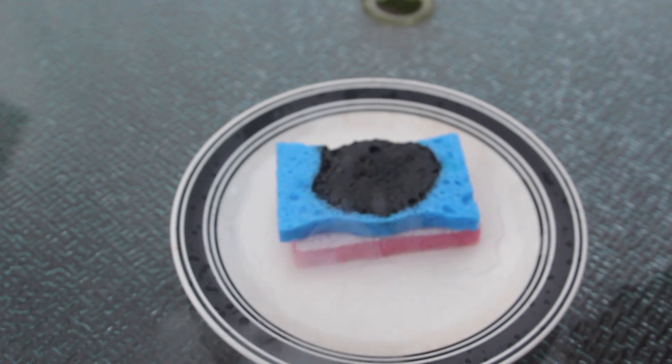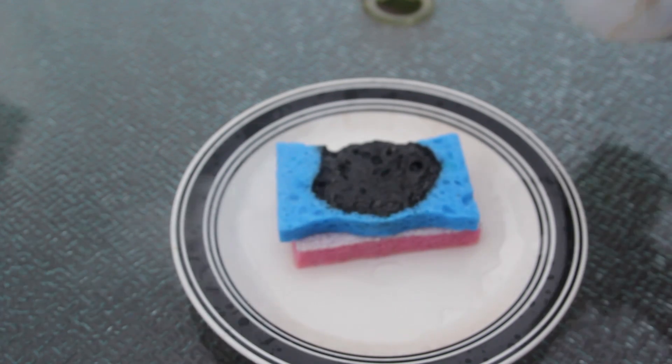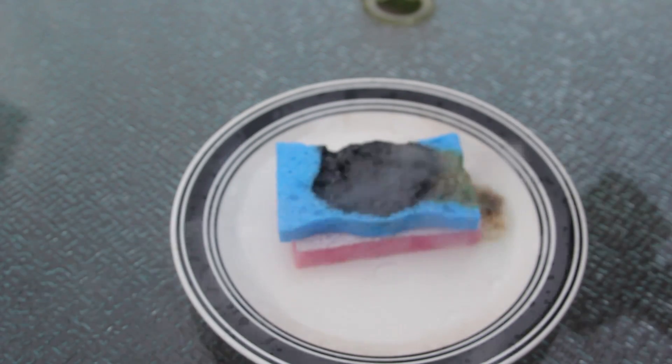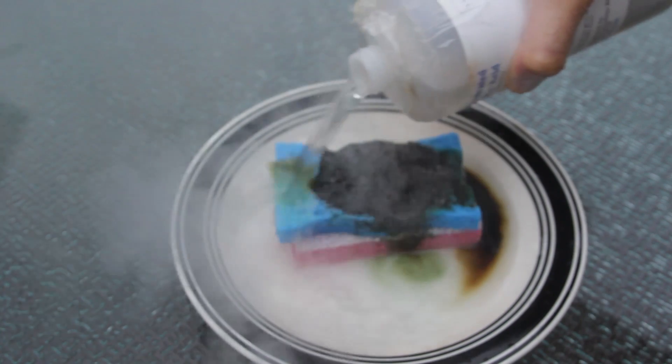Look, it's so crazy. Look, it just burns through it so easily. Why does sulfuric acid do that? Pretty crazy, right?